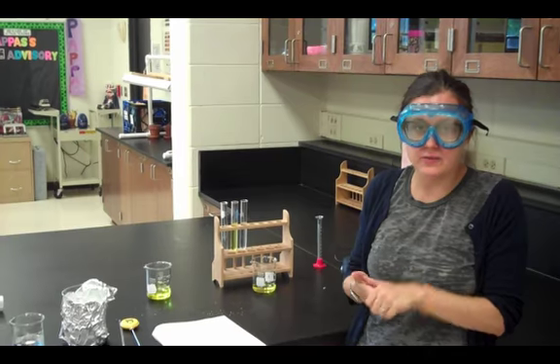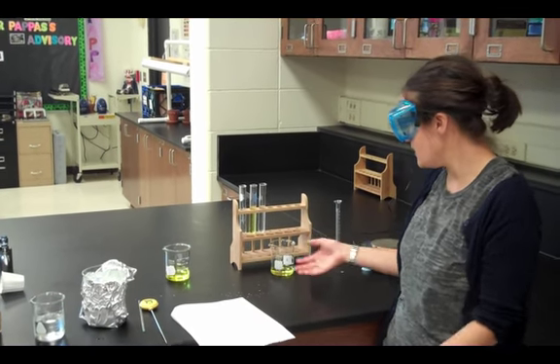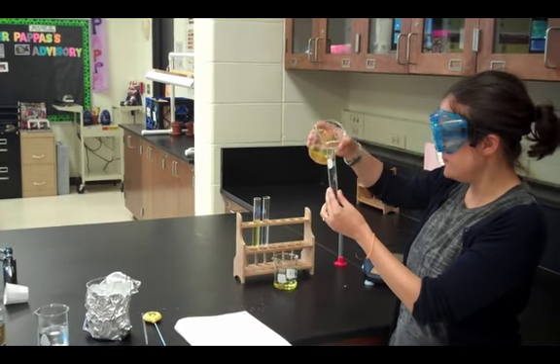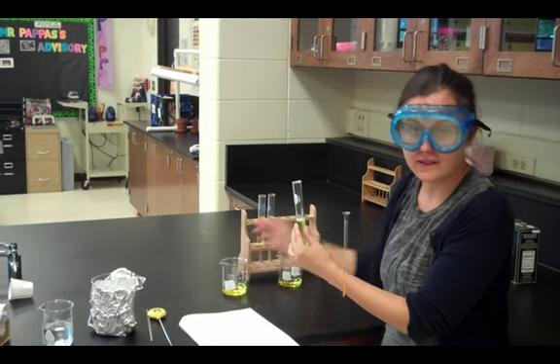Alright, then for solution B, we need to find the freezing point. And you're going to do exactly the same thing you did with A. Fill your test tube about halfway with solution B. Put it in the ice bath.